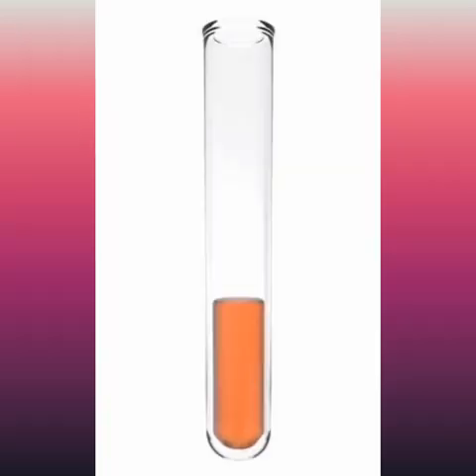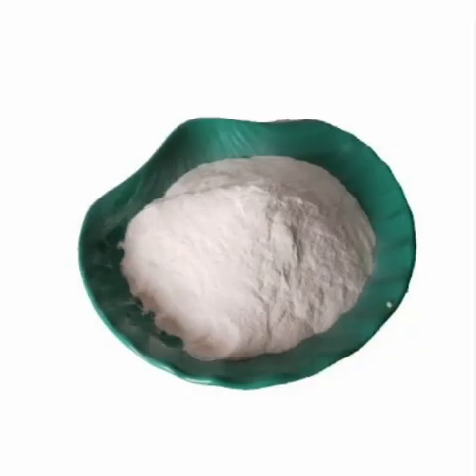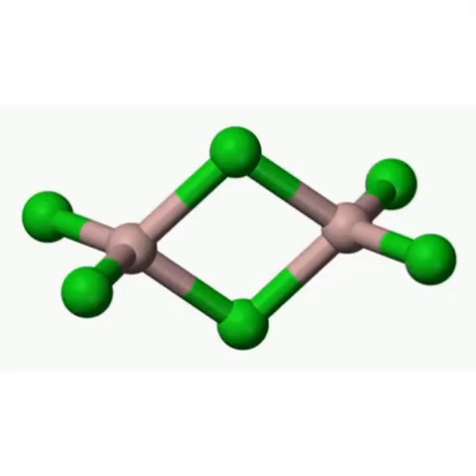Now this next test I'm about to give you is basically the combined form of the salts. When you combine them together, it's going to give you still the same components, but a different formula. And now we are basically trying to find out the CO2, the zinc, lead and everything all over again. This is not a likely question that is able to come out, because to get the results is very difficult, but we are here to supply you the best. So the equation is above.